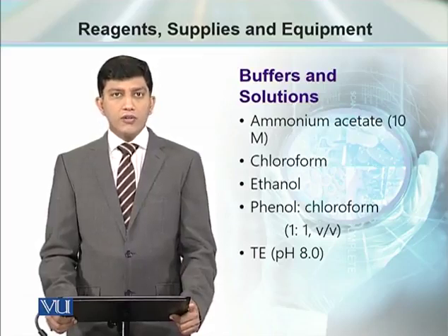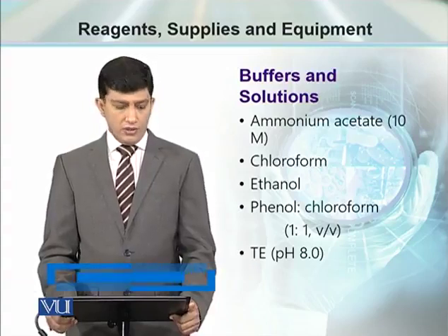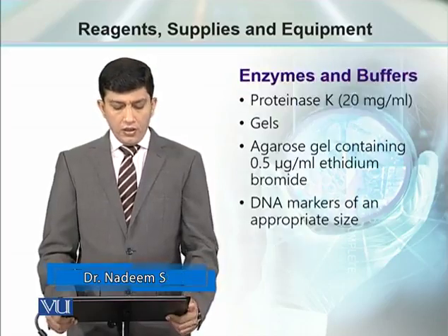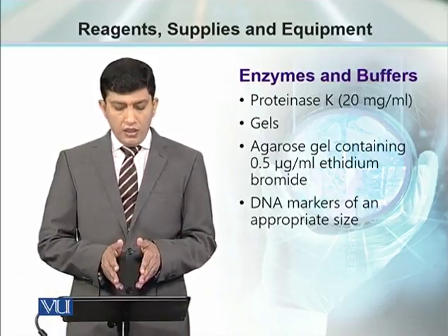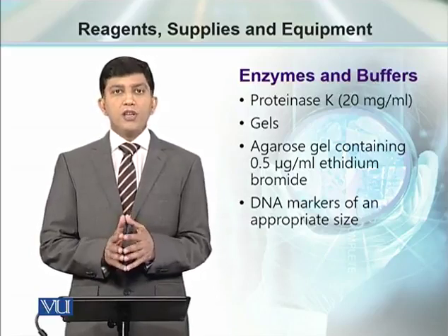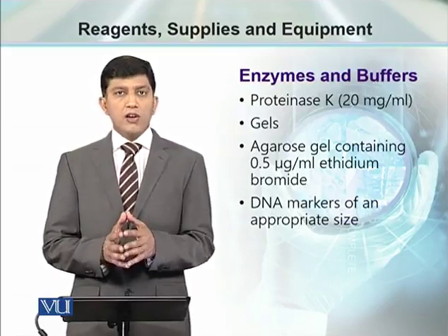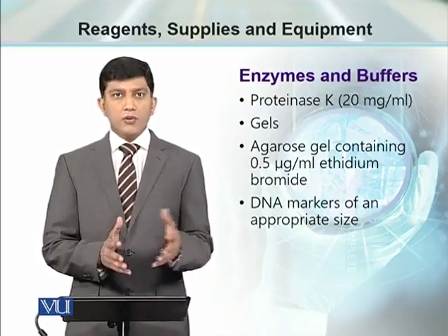Then to dissolve the purified DNA, we need the TE buffer, which is Tris-EDTA buffer, and its pH should be set around 8. Enzymes are required for purification purpose, and one of the enzymes we are going to use is proteinase K. This proteinase K is available in the lyophilized form, that means in the powdered form. This lyophilized form is going to be dissolved as per the instruction if you get it new.